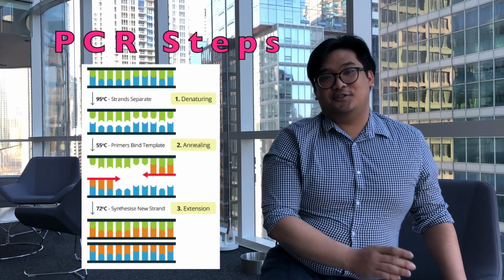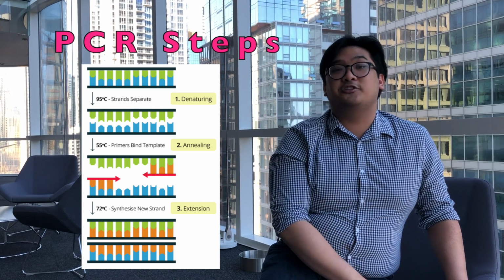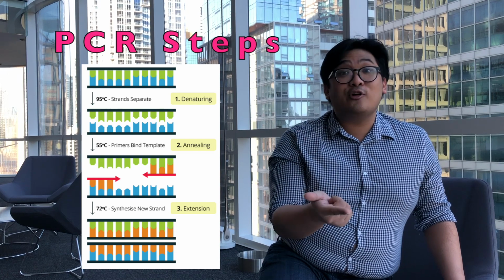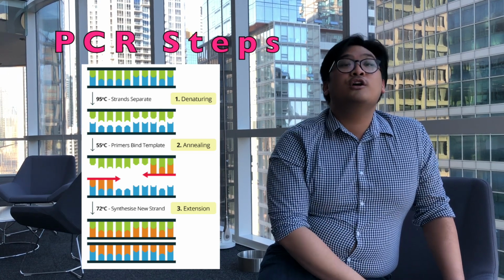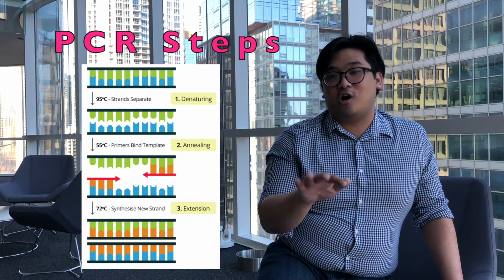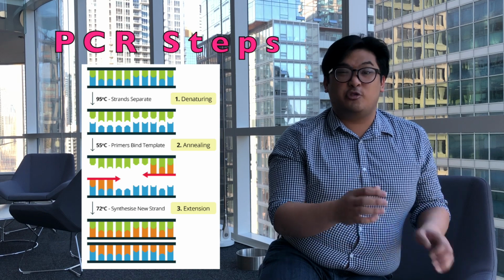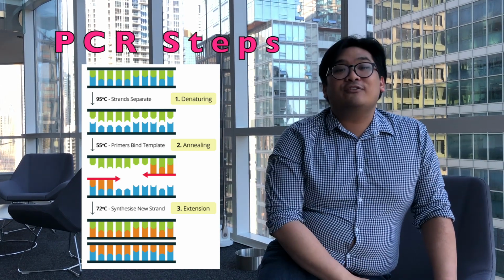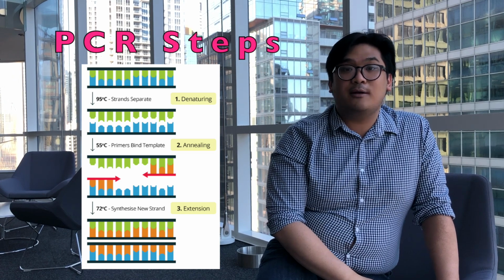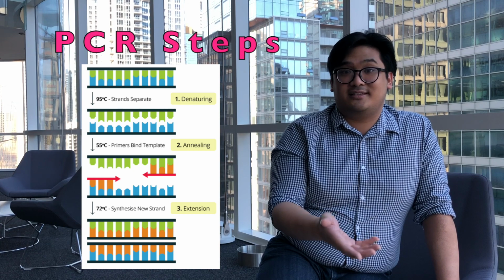There are actually three main steps associated with PCR, which can be carried out in volumes as small as 30 microliters per reaction. You can have the denaturation of the template DNA, primer annealing, and then eventually extension. So what you need is a thermal cycler, so the reaction is subjected to really high temperatures, approximately 95 degrees Celsius, to separate the parental strands by breaking the hydrogen bonds between them. After lowering temperatures to about 55 degrees Celsius, primers can then anneal and bind to provide a free 3' hydroxyl group to facilitate Taq polymerase extension.